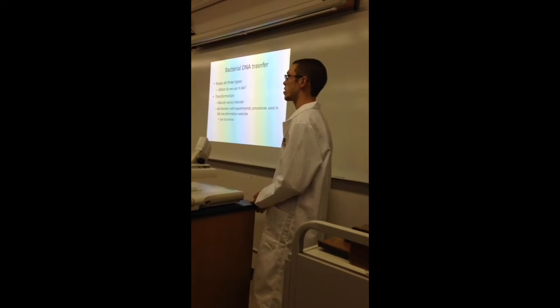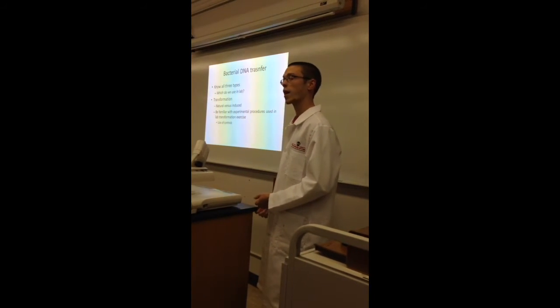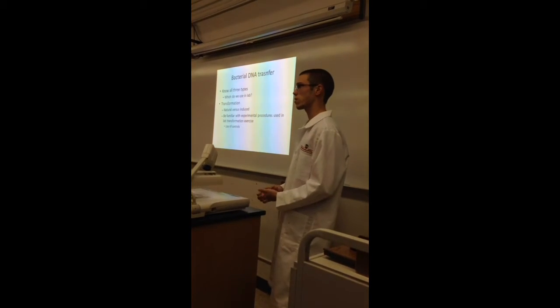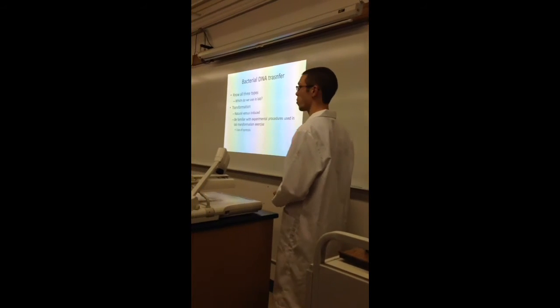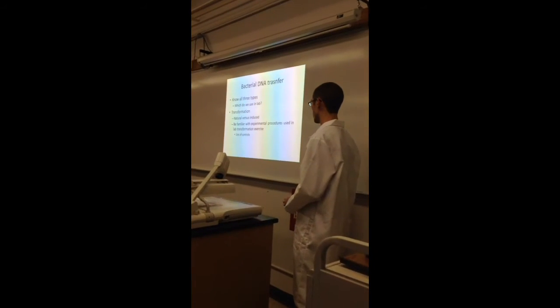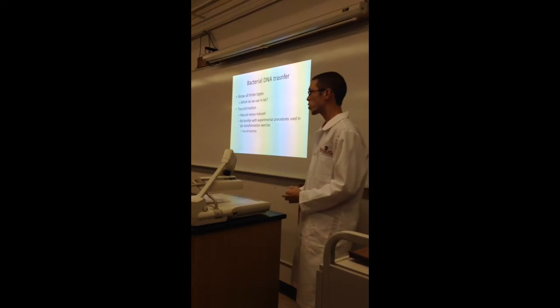The one that we did in lab was natural. It's one that's a naturally receptive bacteria. But in a lot of labs, you have to do induced transformations. So that's things like exposure to calcium chloride, heat shock, electroporation, those types of things. Just be familiar with the methods that can be used, and also the experimental procedures that we used in our own lab transformation exercise, especially the use of controls.